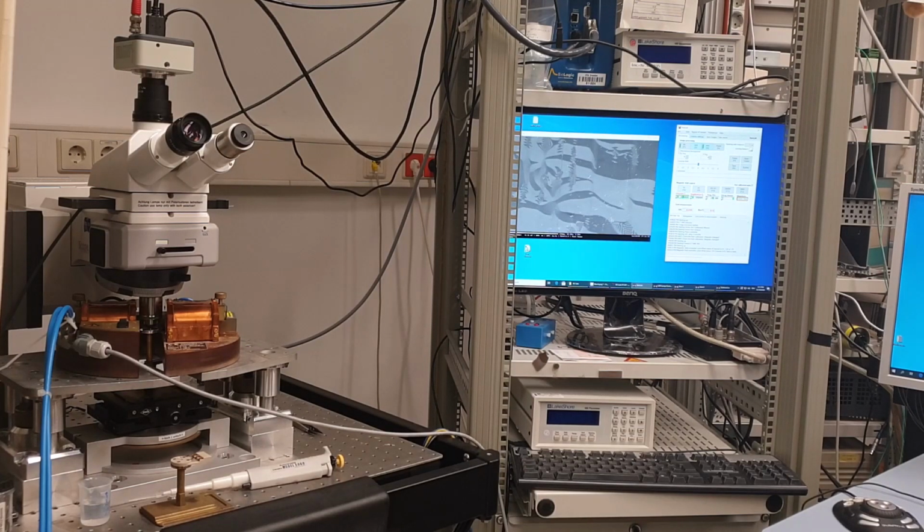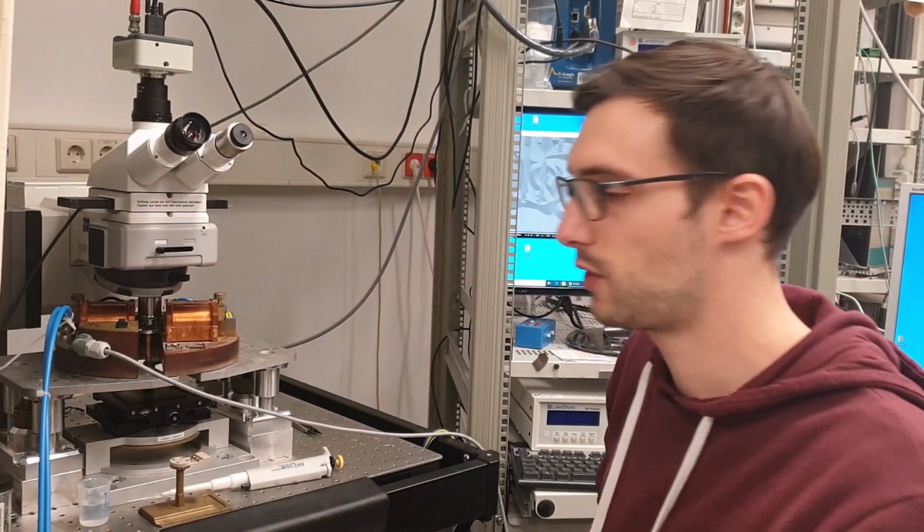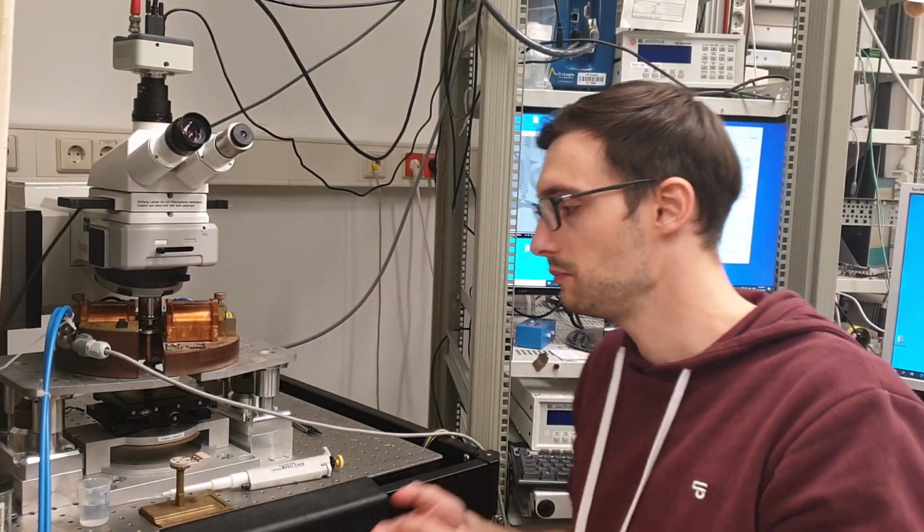And the observed domain patterns depend largely on the degree of anisotropy. And from a domain pattern and the domain reversal process, we can also obtain valuable information for the overall magnetization process by comparing, for instance, the virgin state with a state which is changed, for example, due to an electrochemical reaction.